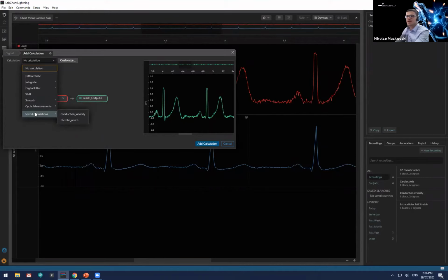And the save calculations is an option there. Once you create your own calculation, you can save it, and in this way you can see it here. This we'll talk about a little bit later on in the webinar. But now, just to review some basic calculations here.